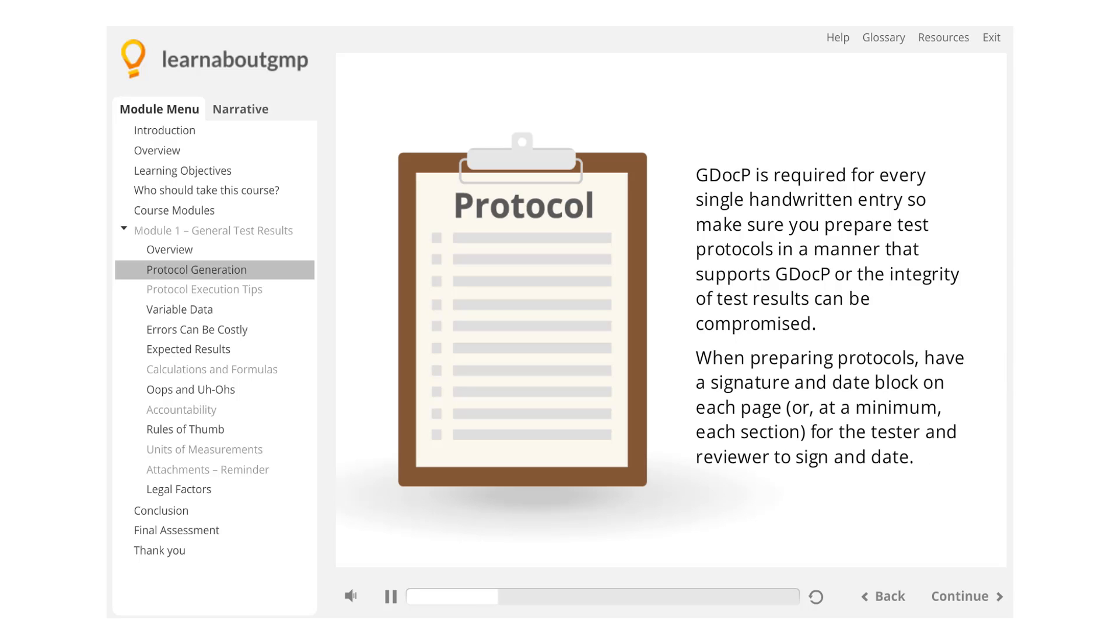have a signature and date block on each page or, at a minimum, each section for the tester and reviewer to sign and date.